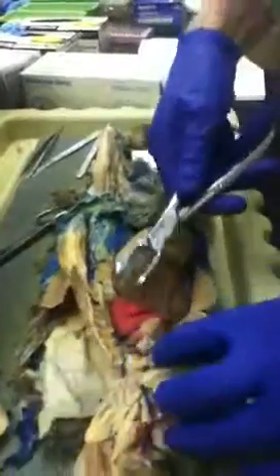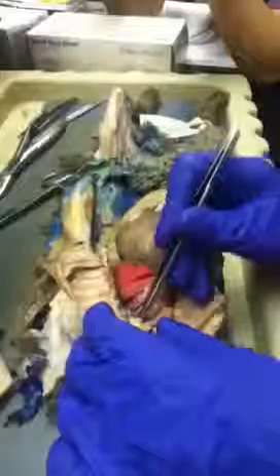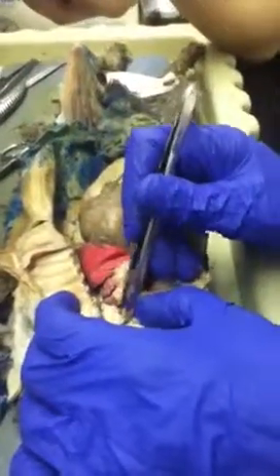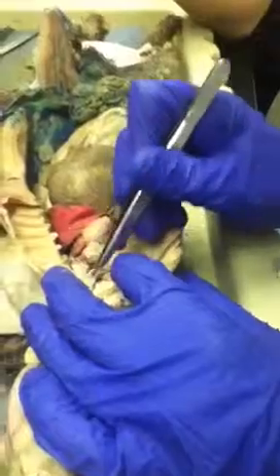Now, what I'm going to do, let me just grab another tool in here. Excuse me. I seldom use this, but these are handy for cutting bone. And I'd like to just kind of open this up a little more, so I'll snip out the rib ends. That's pretty good. We'll see what the aorta is up to here. Okay. Some more thymus out of the way there. Aortic arch, expose that.